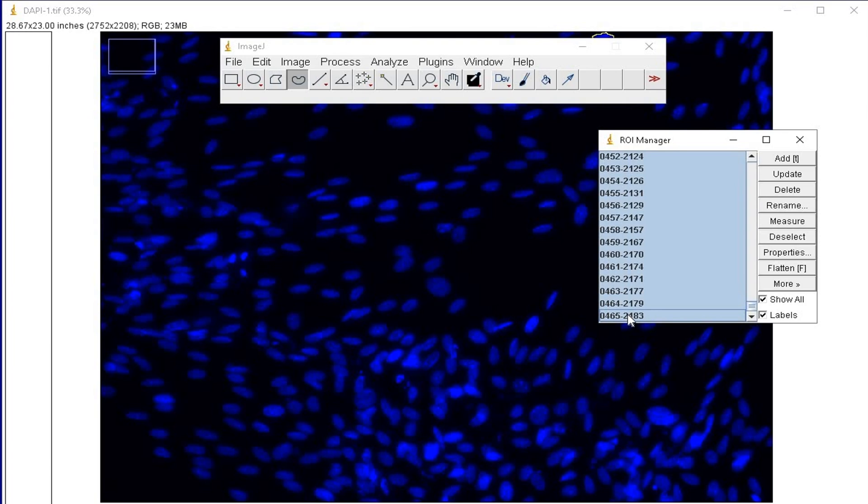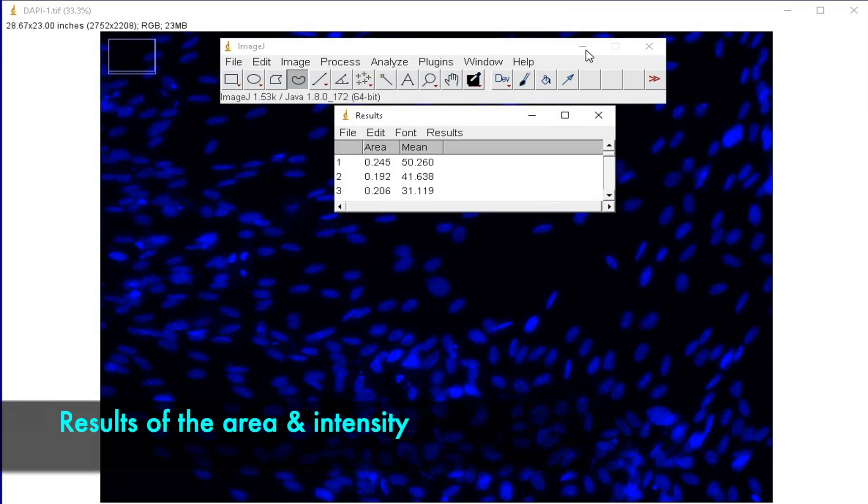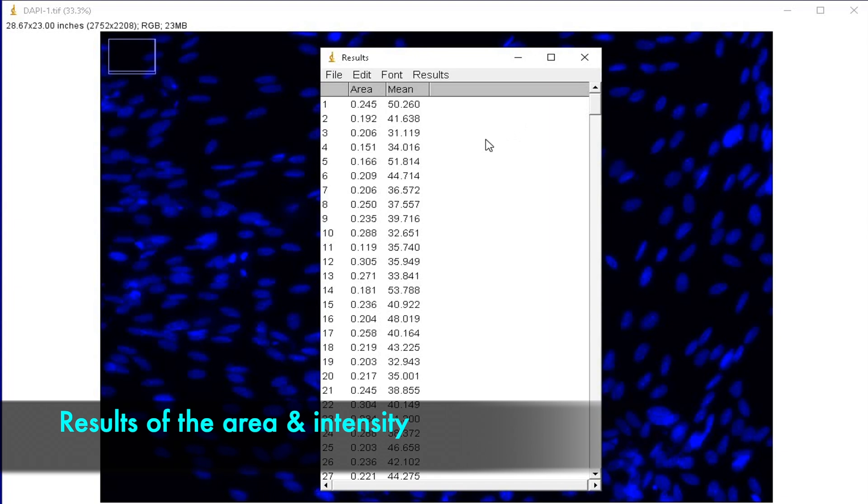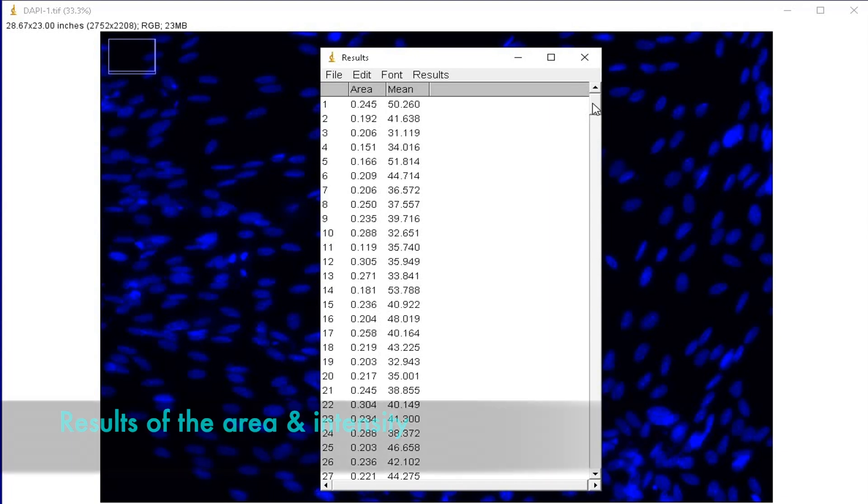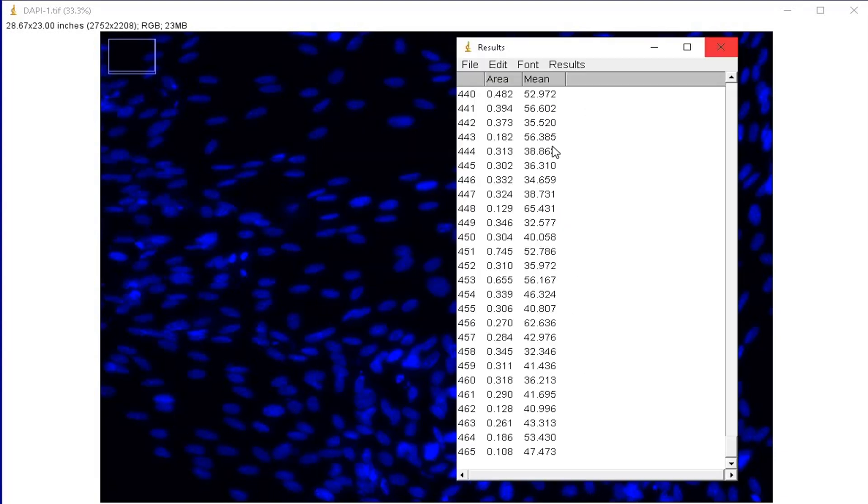Now, click on Measure. The results show the area and the mean intensity of all the 465 cell counts.